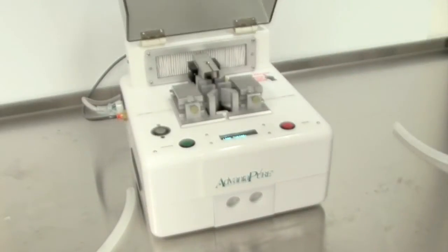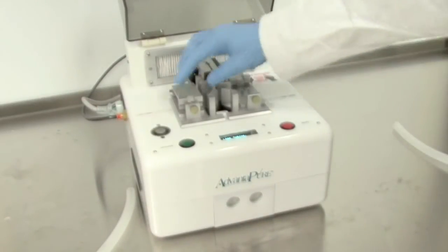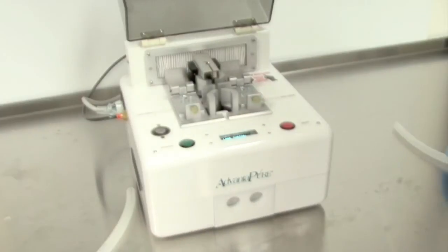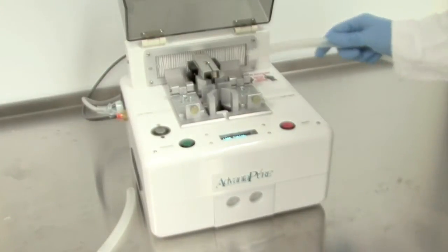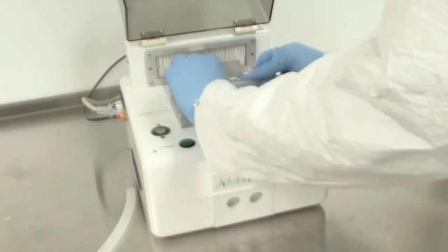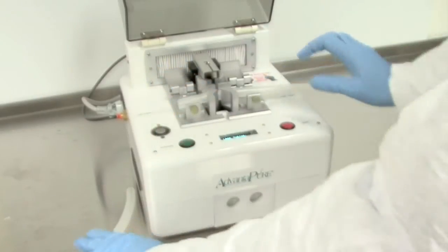Advantiflex tubing may be welded using equipment designed specifically for this purpose. This machine, the Advantatube sterile welder, holds two sections of tubing in place with clamps as it performs a sterile weld.